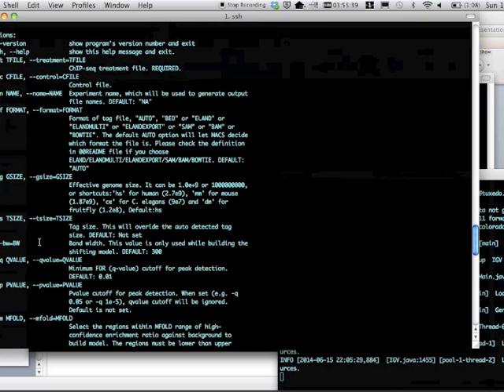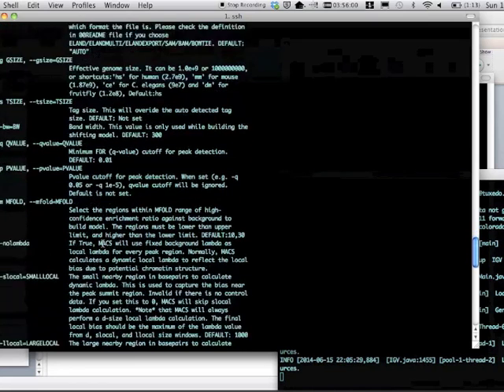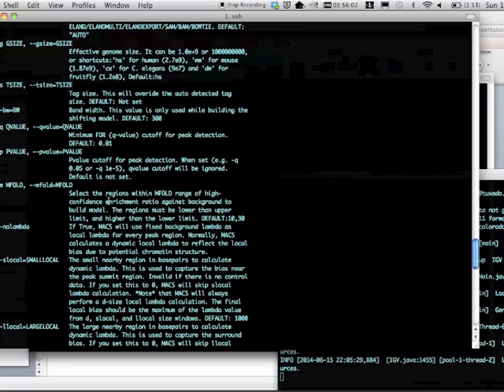Some other settings you can play with are, as I mentioned before, this bandwidth. So you can set the value to use in the shifting model. You can also custom set the q values and the p values. I set a q value, and it's actually the same as the default. Once again, I do this to keep an annotation. mfold is the amount of enrichment it uses to build the model. I like to just go ahead and keep that at default.